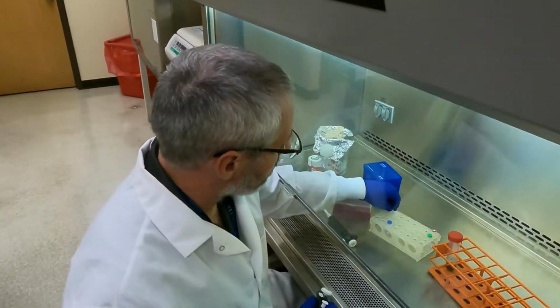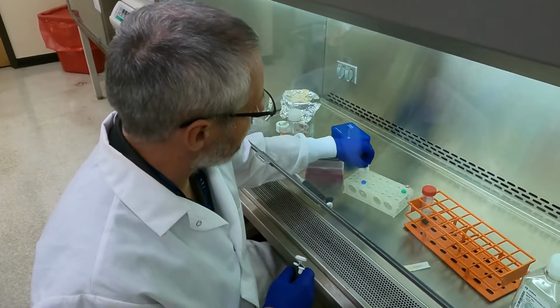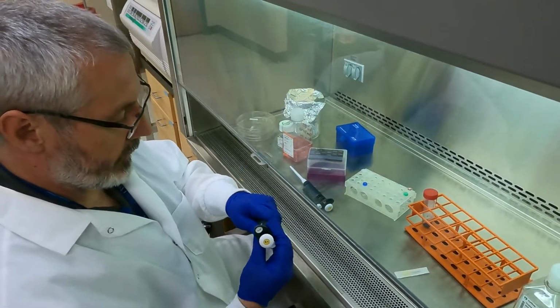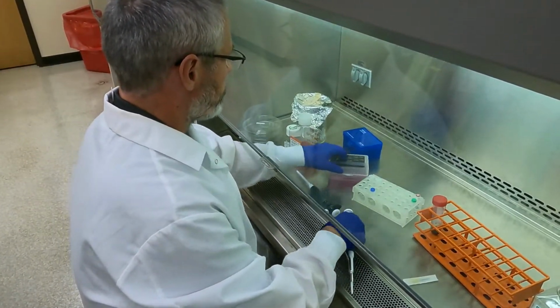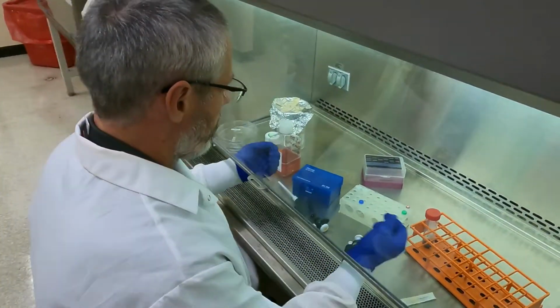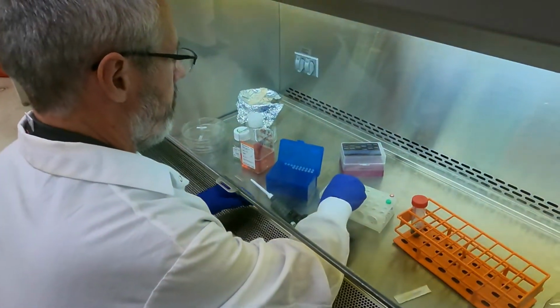Now we've got our 2 complexes here. We've got to add electroporation enhancer. We don't really know what's in there, but we're going to use 10 microliters each. Okay, and this will enhance the electroporation. So what we need is these guys here. Okay. Right, there we go.